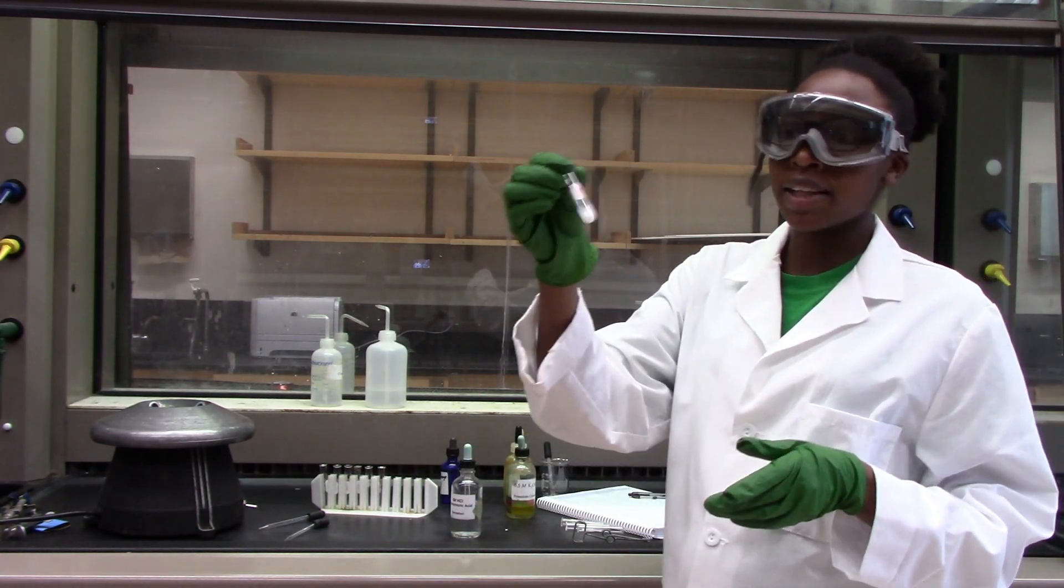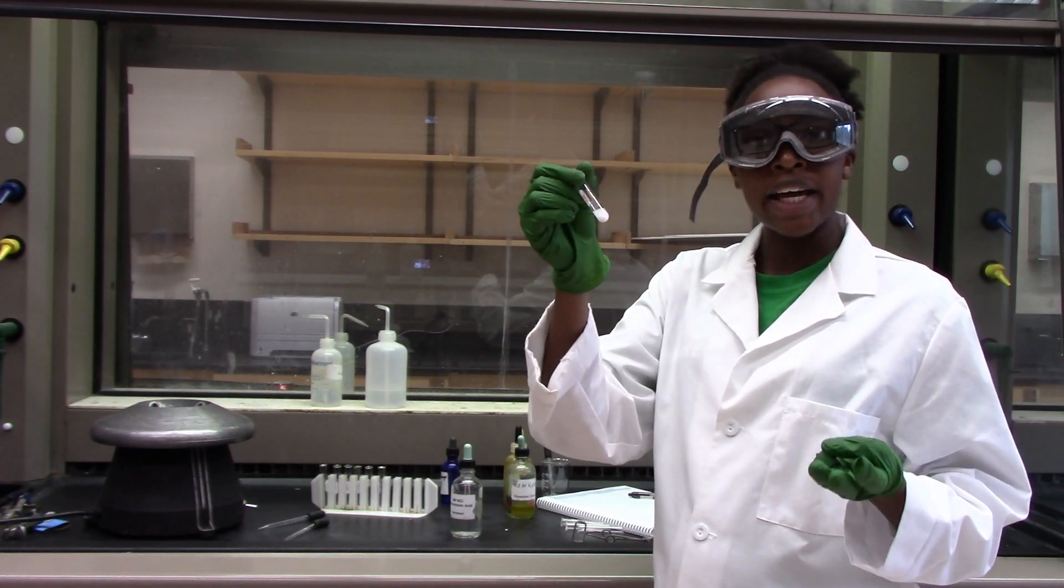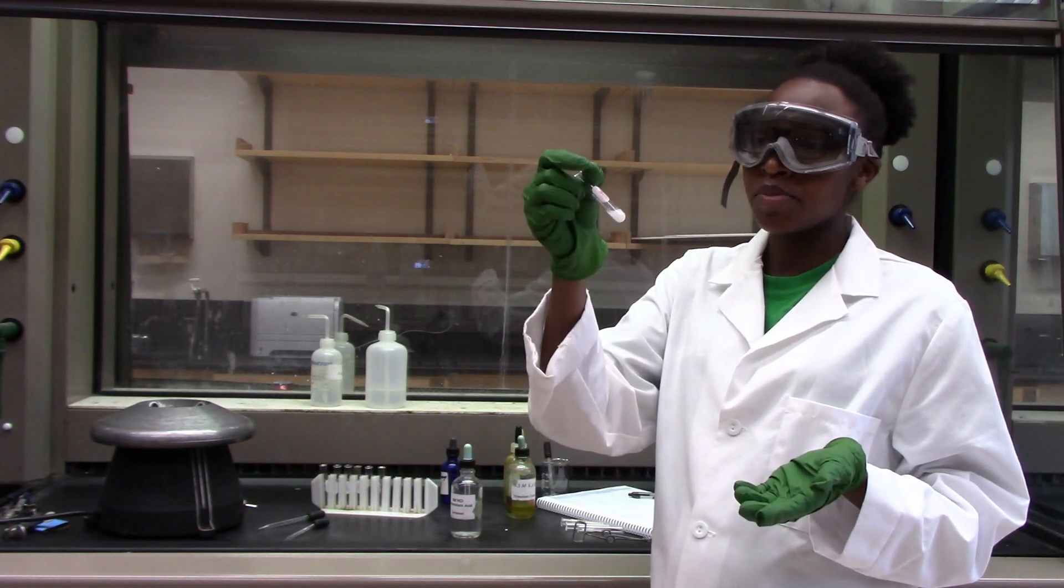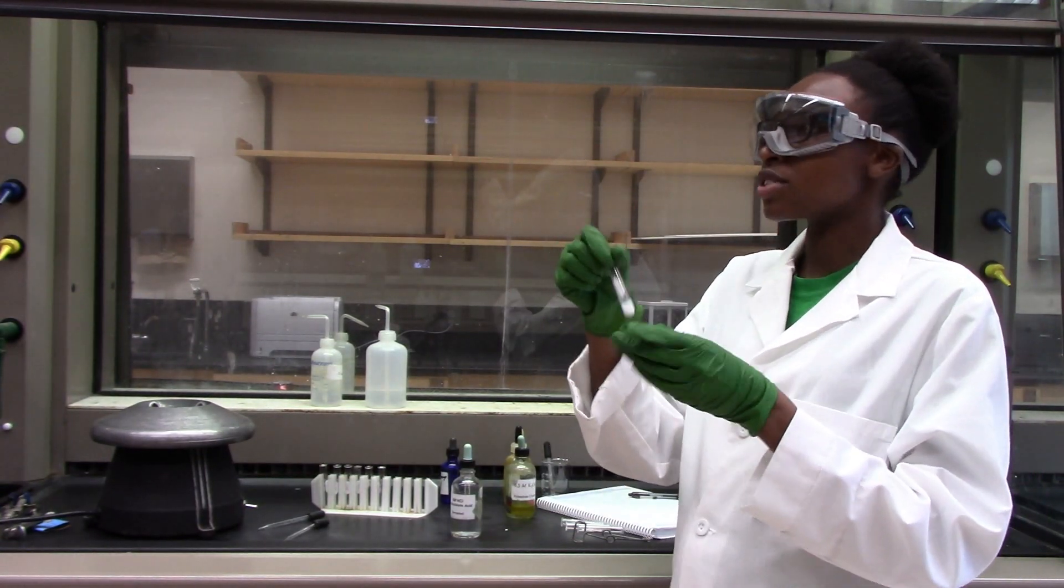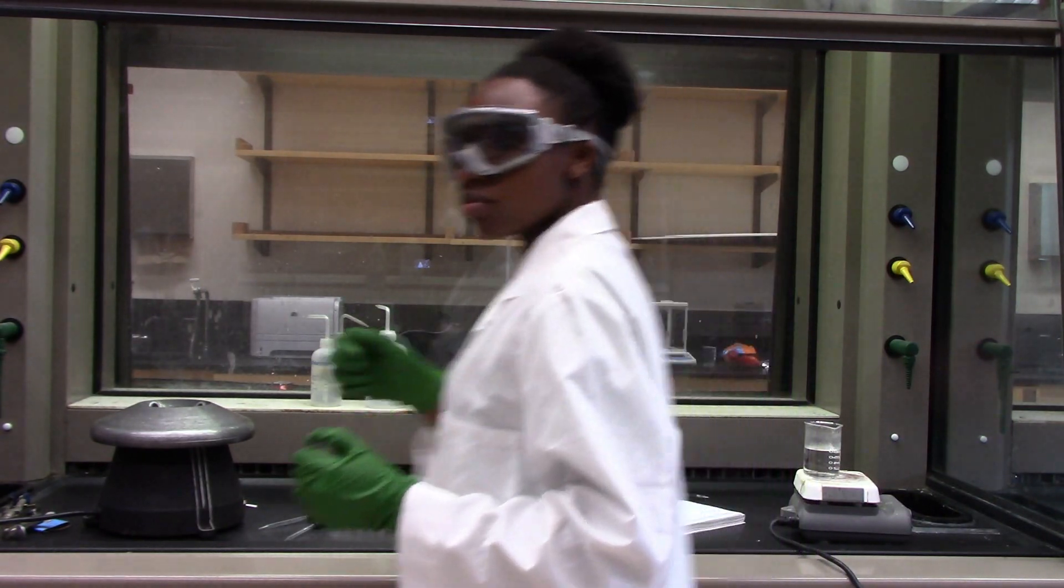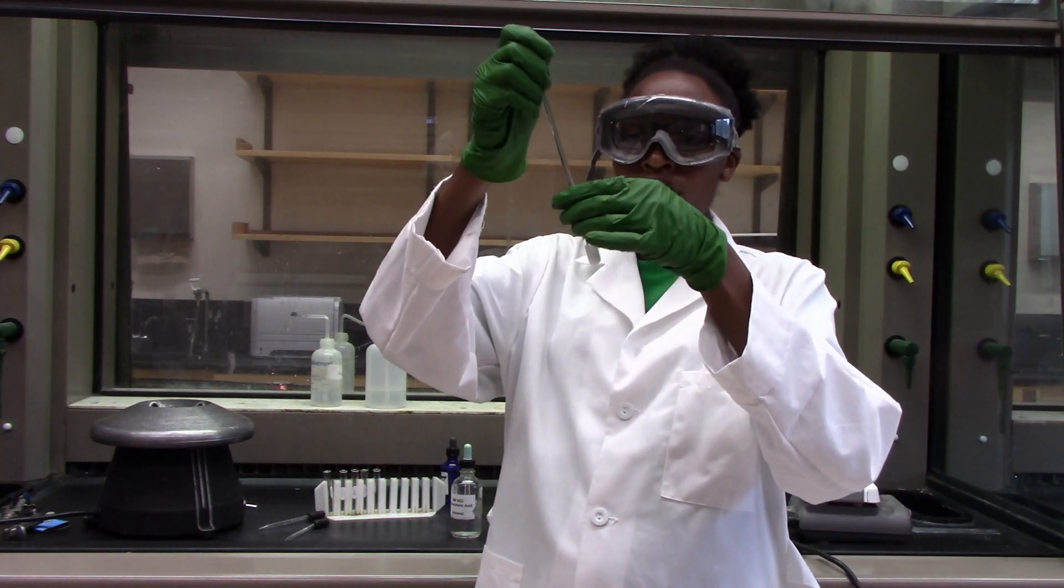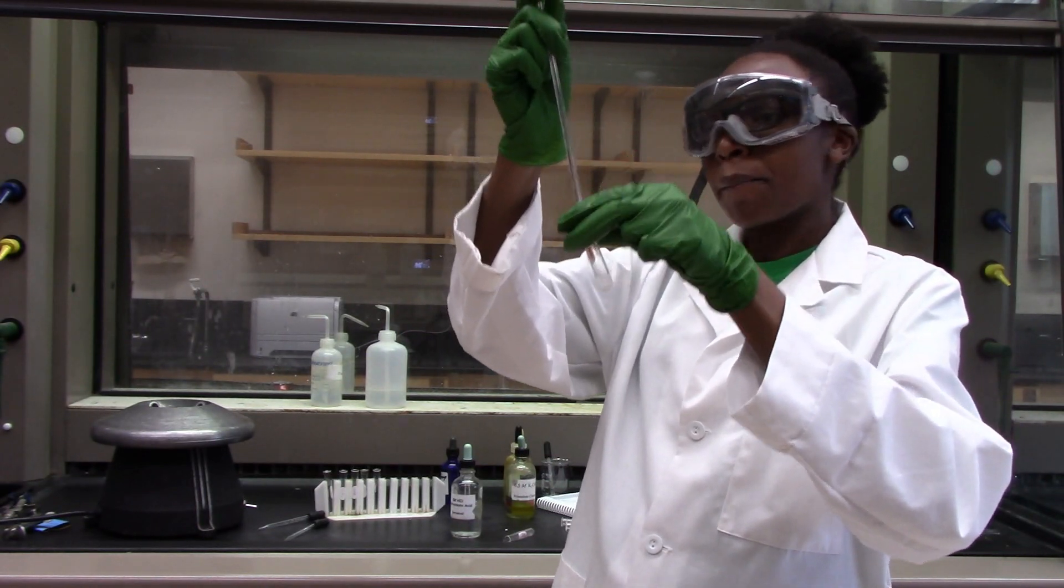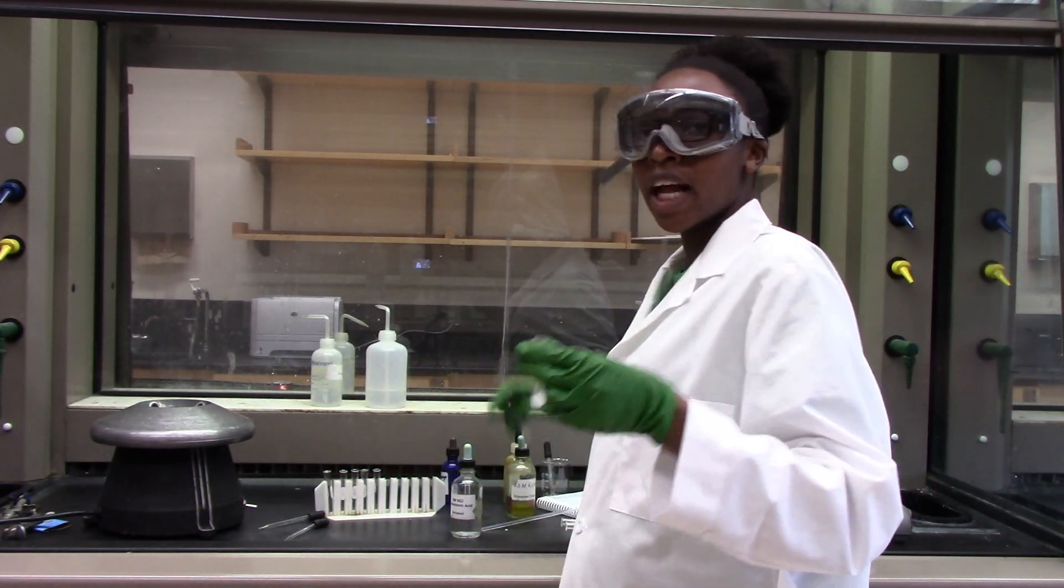Right away you can see that we have a white precipitate. That should tell us that there should be some either lead or silver or mercury or all of them in this precipitate. I am going to mix this and centrifuge it.